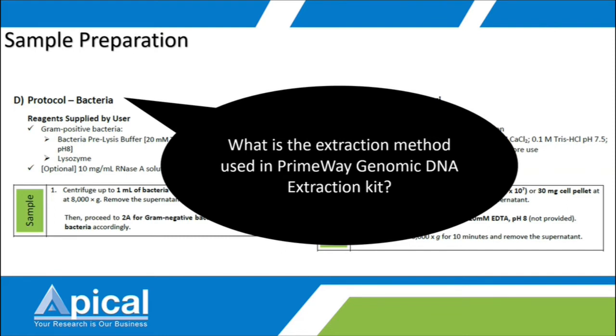Silica spin column method. Yes, it's silica spin column method. Most of you are correct. Wow, you all pay attention in the webinar. Very good. I'm so happy. Yes, you all are correct. So it's the silica spin column method.